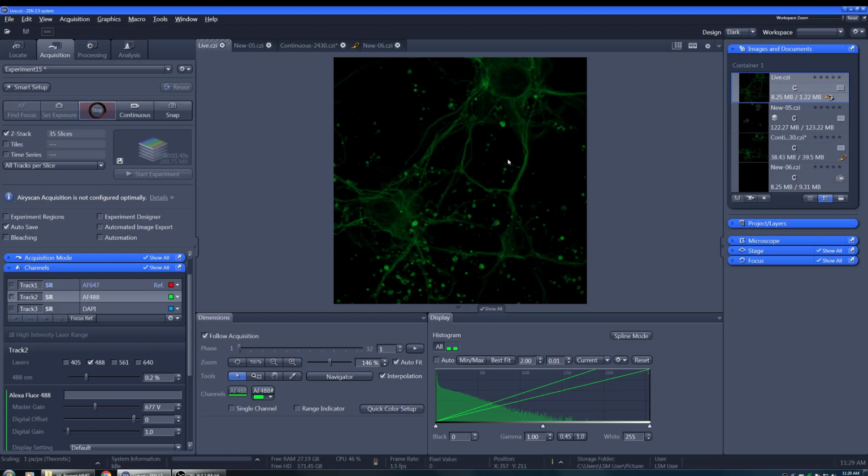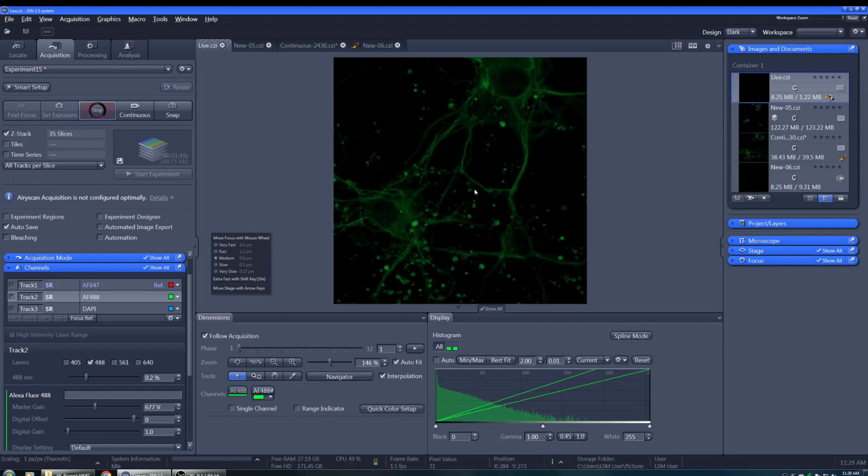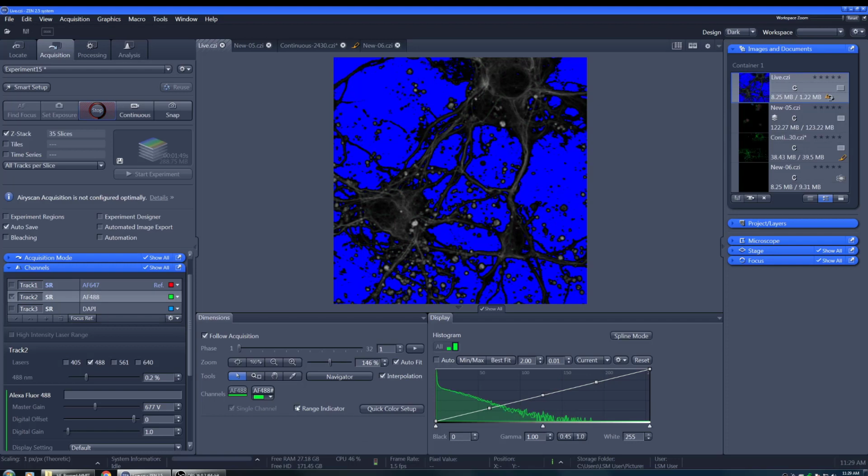And in order to set the light and the gain in the channels tab, you go through the sample. I press Control now and scroll with the mouse, and you can see the histogram down here that this is about the focus plane that gives the highest intensity, and you should of course not overexpose.